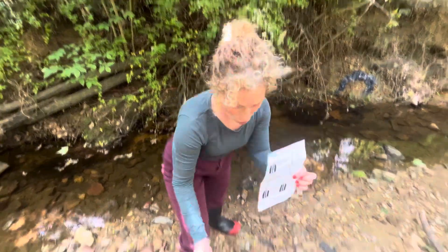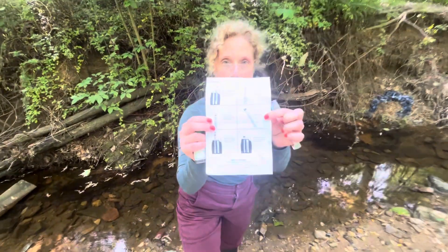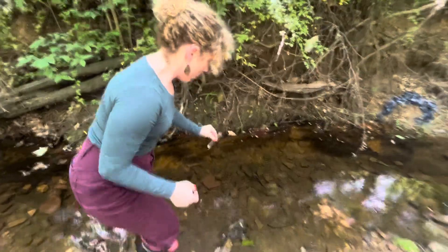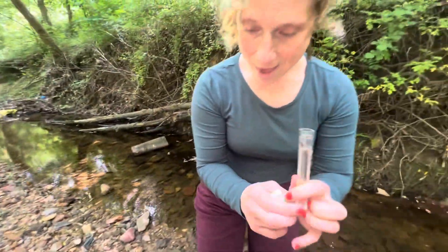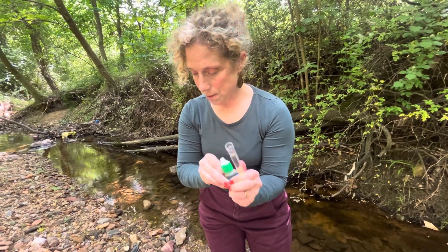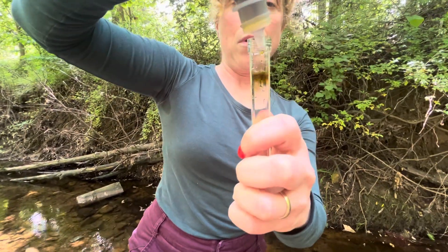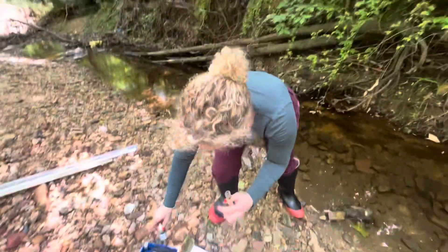The first test we're gonna do is the pH test — it's in this blue container right here. If you forget how to do it, the directions are right on here, but I'm gonna show you how to do it. You're gonna take out one of these little tubes, fill it up, and then add in ten drops of pH indicator — one, two, three... ten. Then flip it and mix.